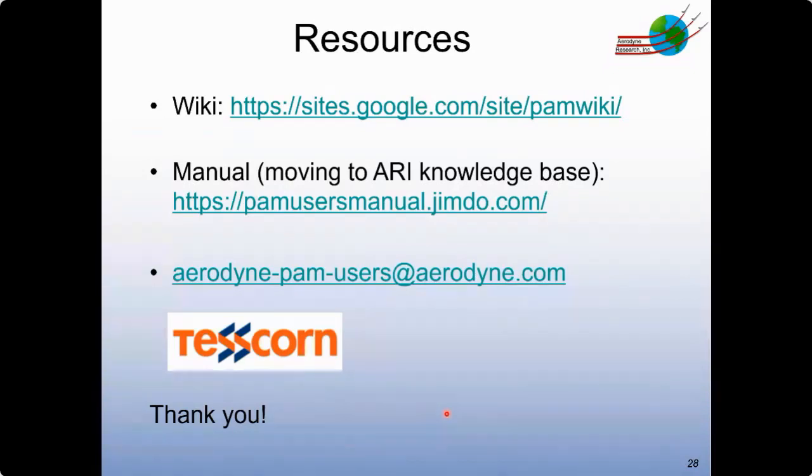It's a good question. The effect of humidity: the first thing to realize is that with an OFR, when you change the humidity, you also change significantly the OH concentration as well. So in order to target the effect of humidity specifically on SOA formation, you have to be able to use the estimation equation that I developed, or the model, to decouple the effects of humidity on OH exposure from humidity.